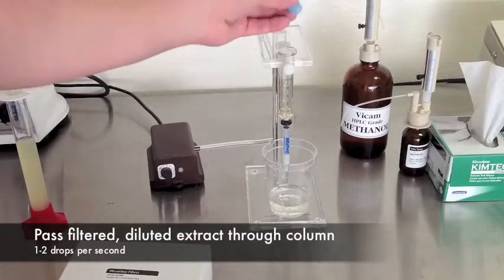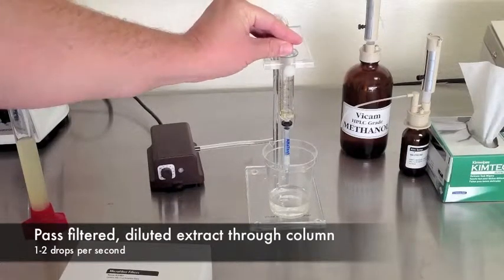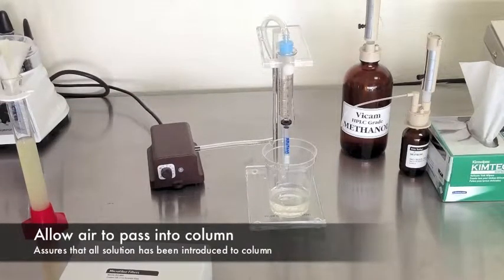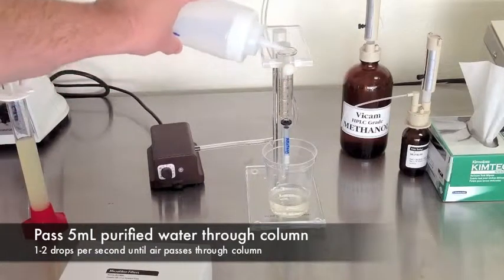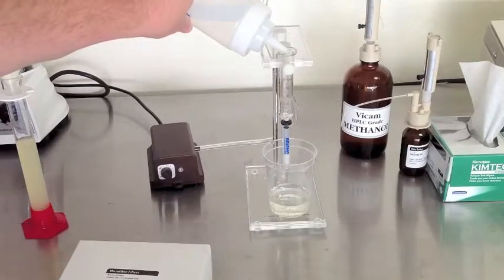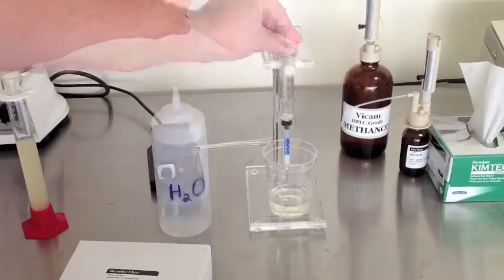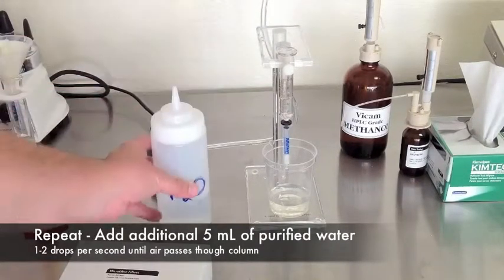Attach the air pump to the top of the syringe and carefully adjust to get one to two drops of sample through the column per second. This will take a little practice. When the sample is done dripping, allow air to flow through the column. Measure 5 milliliters of purified water to wash the column. Pass one to two drops per second through the column. Once air has passed through the column, repeat the last step — add 5 more milliliters of water and repeat.